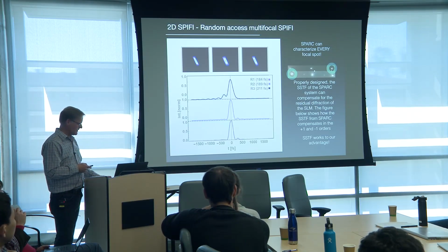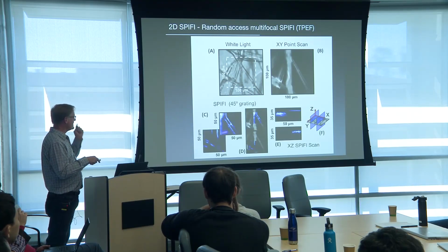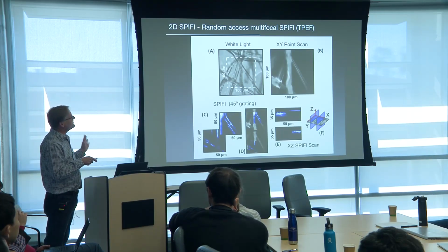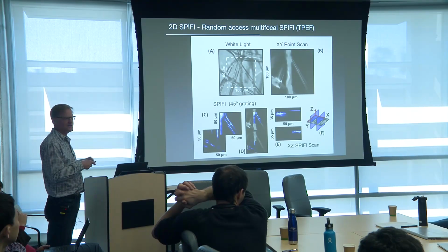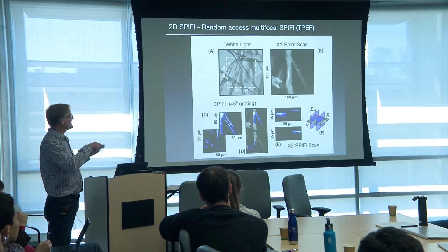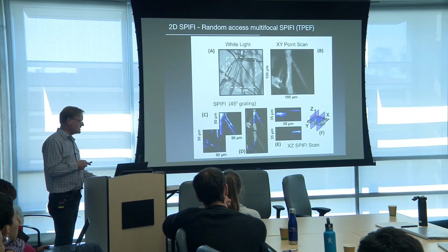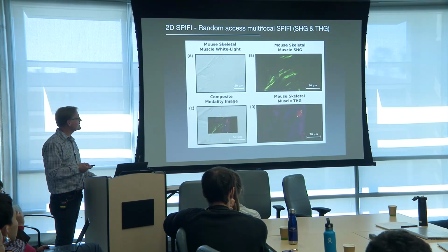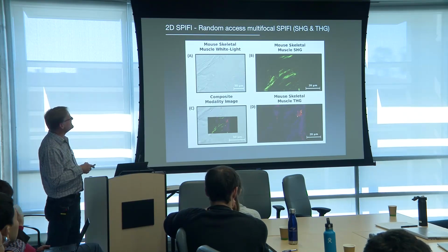And then this I'll go through really quickly, because now we just show that, using a very simple setup, my lab uses a lot of fibers to image, but just showing that with these foci we can get separate images at different fields of view. So this is 2-photon fluorescence. This is doing second and third harmonic imaging. And this is all raw data.